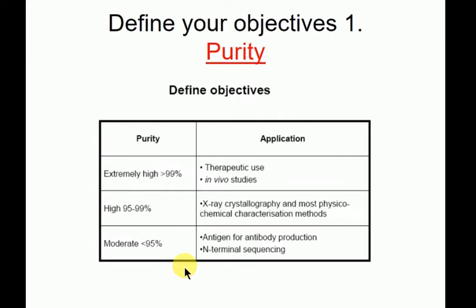Cryo-EM, you can kind of select the particles out. You'd still prefer them to be really pure, but cryo-EM allows you to be selective. So with the more modern structural techniques, you could get away with being at the lower end there. And then at the really high end, 99%, is where the pharmaceutical companies developing protein-based drugs need to be. So they need to be essentially homogeneous, just that protein.